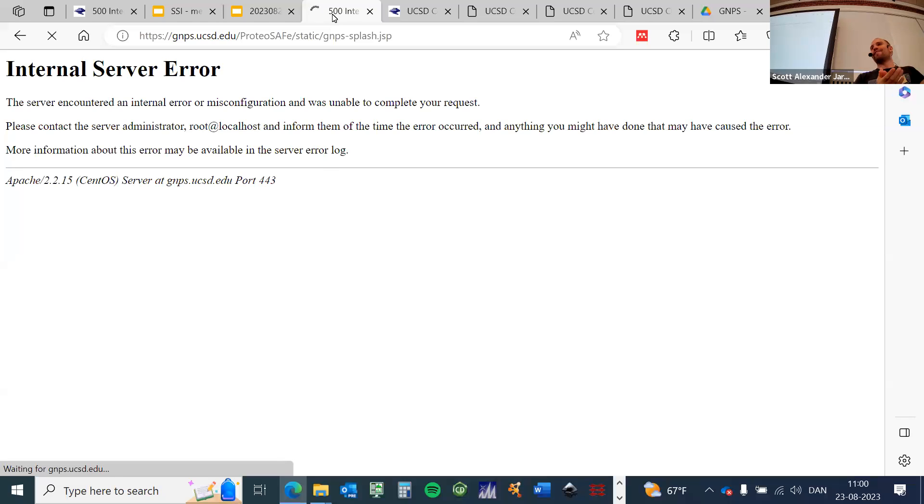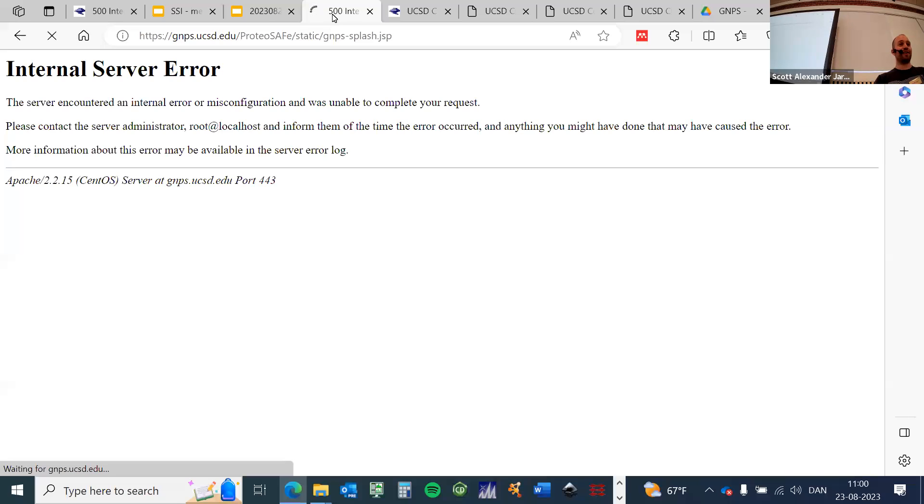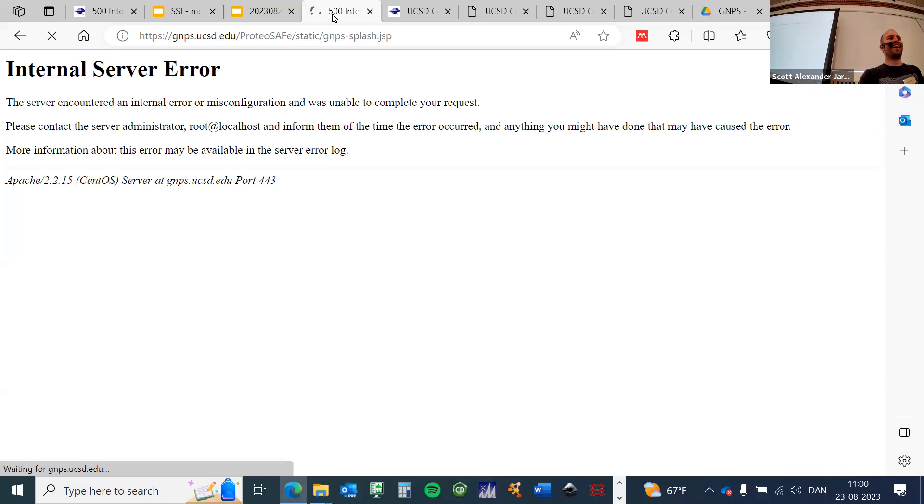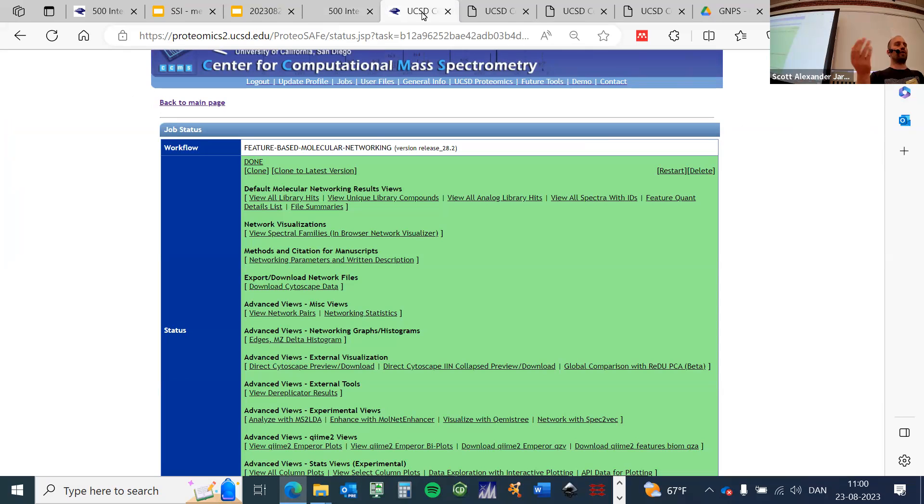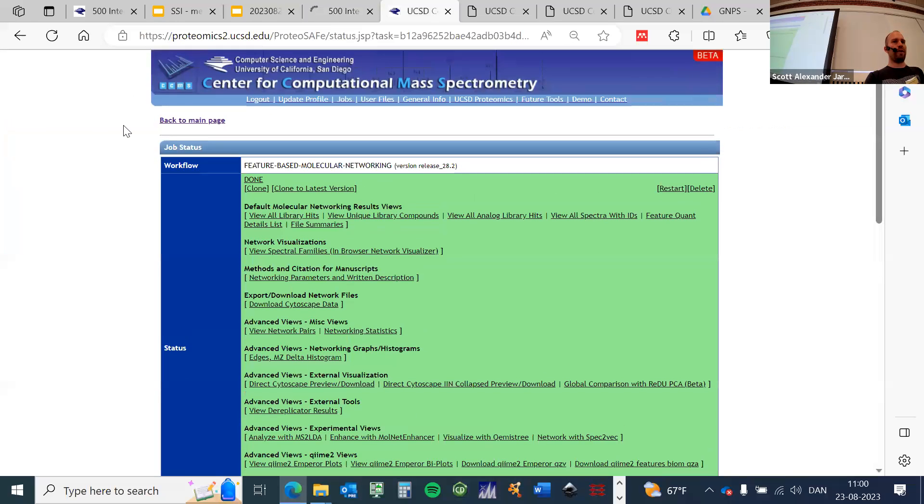So we eventually need to wait till Ming wakes up later and reboots the thing. Fortunately, we do have a backup server for situations like this and for beta testing. So we could actually open the job here on our beta server.